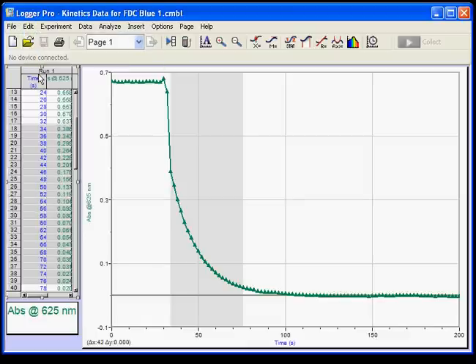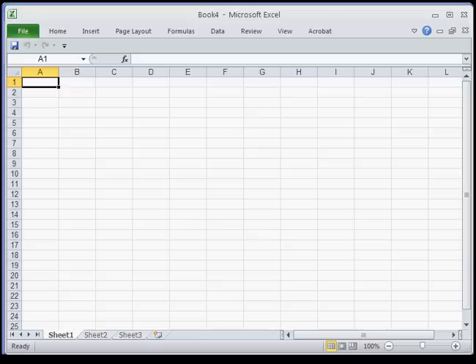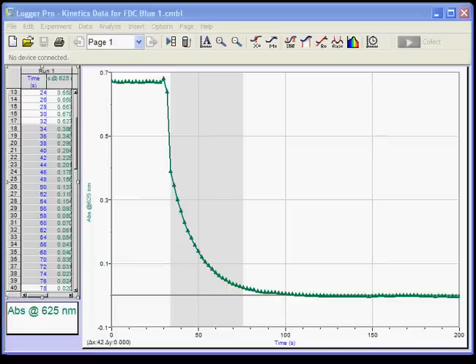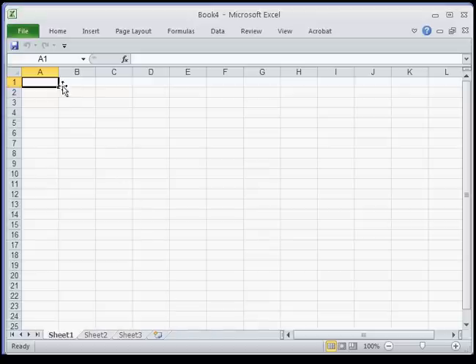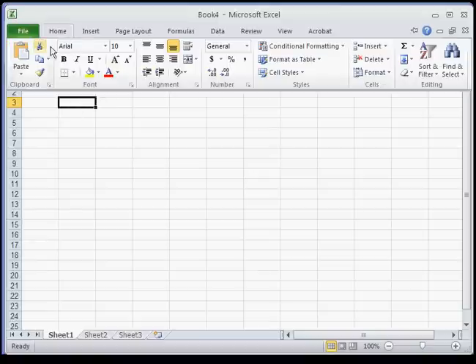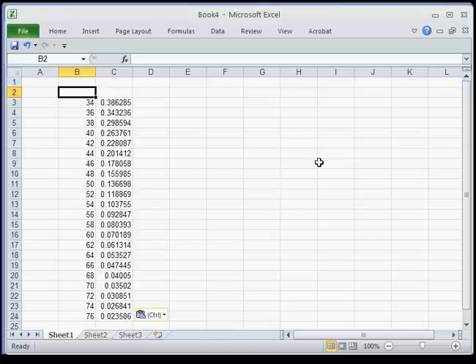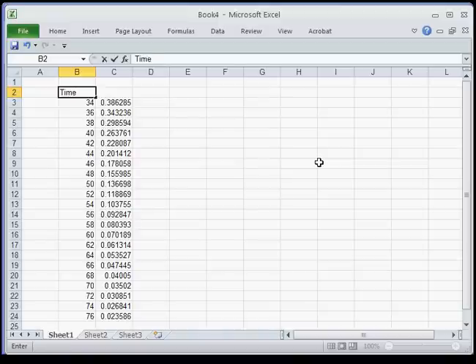I'm just going to copy that. Next I'll open up an Excel file and paste that data in. I want to paste it down here because I'm going to want to put some headers on top of my data. This is time. We're going to have to fix that because we don't want to start our analysis at time equal to 34 — it's more traditional to start with time equal to zero.